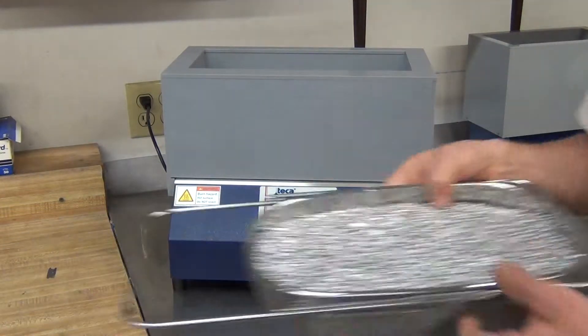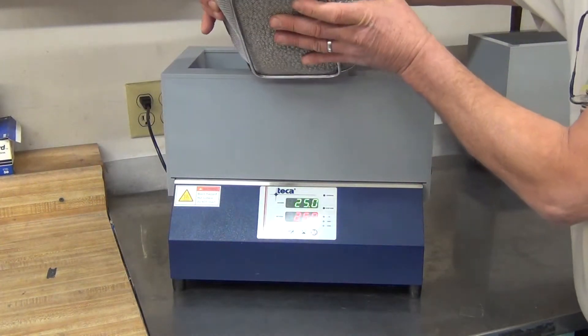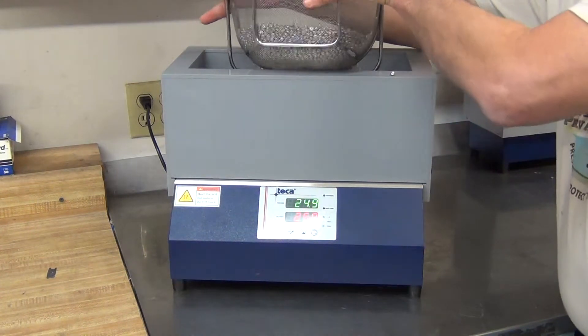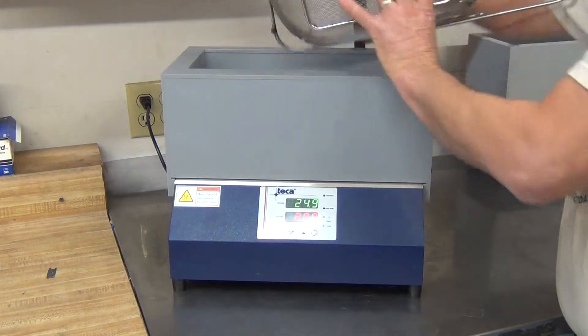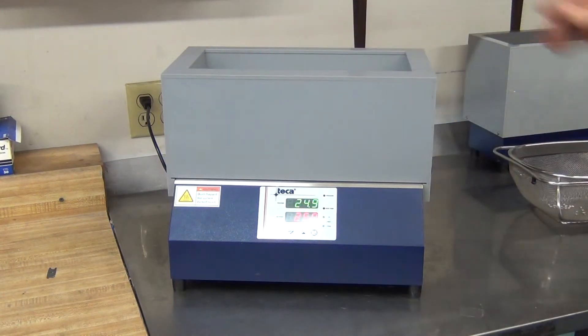What's used inside? TECA Lab thermal beads. Pour your thermal beads into the unit.